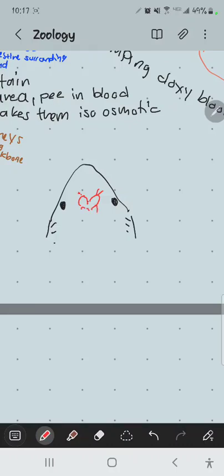So the brain kind of looks like this. There's 5 lobes of the brain. This is all in the cranium. So you're going to have to shave off not only the top of the skin, but the top of the cartilage of the cranium to actually see all of these. And it's about maybe 1.5 inches or 2 inches of length. So it takes some doing. But once you open it up, you can get an idea.